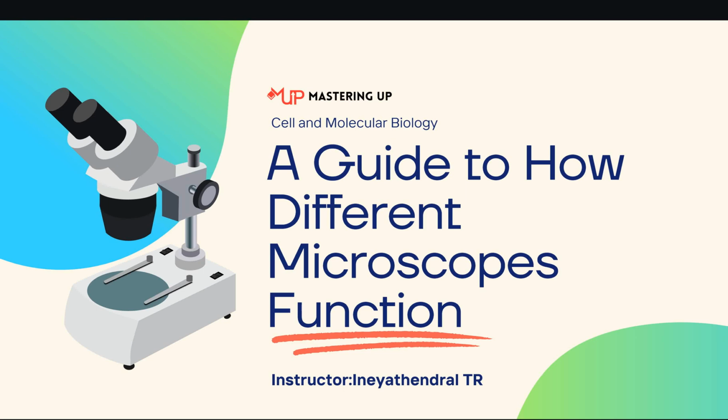In this video, we will cover the main types of microscopes: the light microscope, electron microscope, and then fluorescent and confocal microscope, examining how they work, their advantages, and what they reveal about cells. All these will be covered in this video.